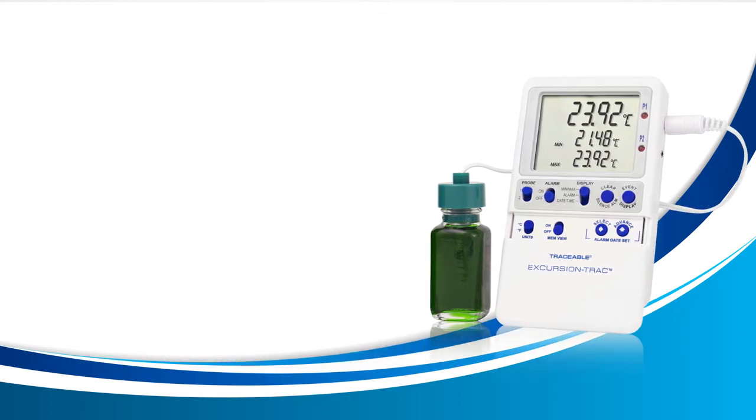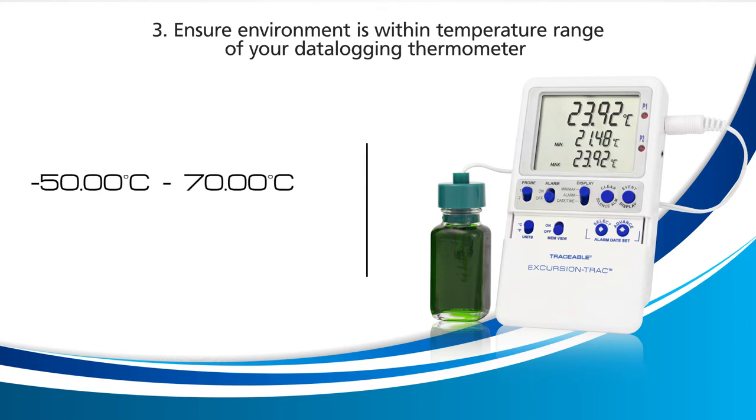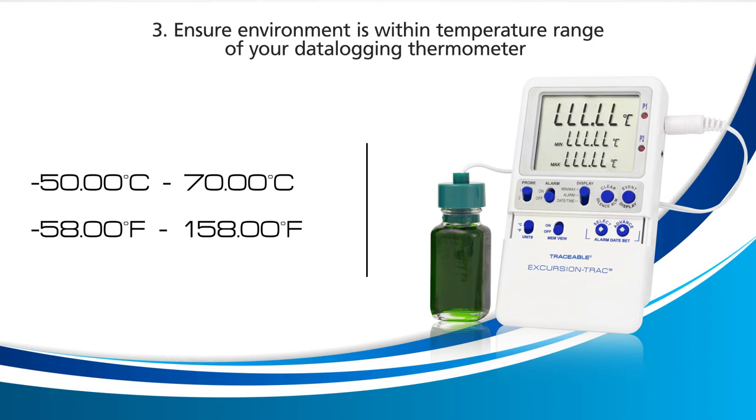If the error remains, let's try the third remedy. Ensure you have your probe in an environment inside the temperature range of your data logging thermometer. For this thermometer, the temperature range is negative 50 to 70 degrees Celsius and negative 58 to 158 degrees Fahrenheit. If your probe is detecting a temperature above or below these ranges, your device will display LLL.LL. Ensure that the temperature environment is within these ranges and see if the error goes away.